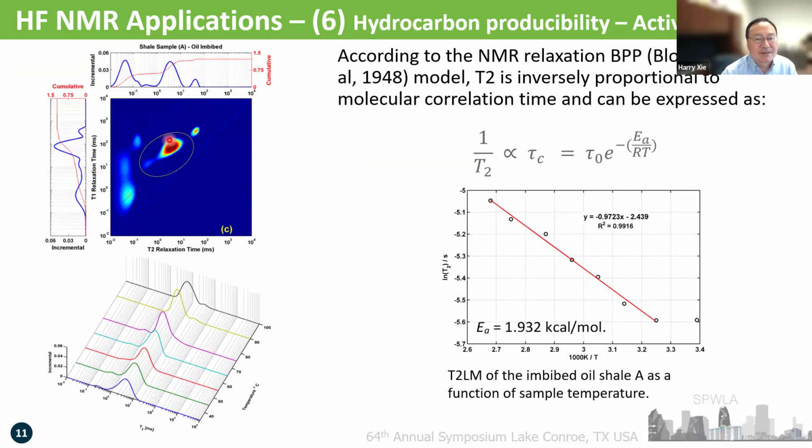So this is a T1, T2 map from Eagle Ford. You probably know the Eagle Ford. You can see there's no water in this. You probably have some very, very tight hydroxyl inside. So with the sample, we imbibe some oil into the sample. That's why this oil signal is very strong.